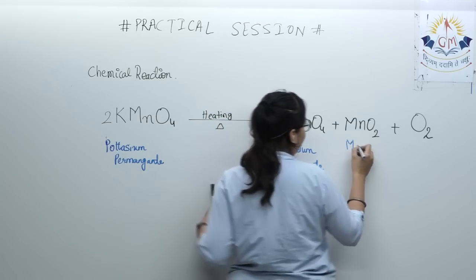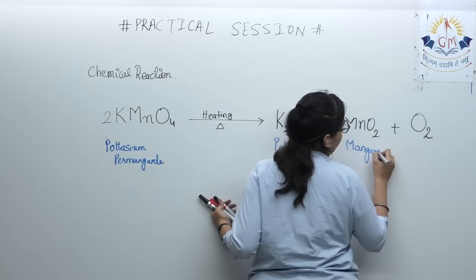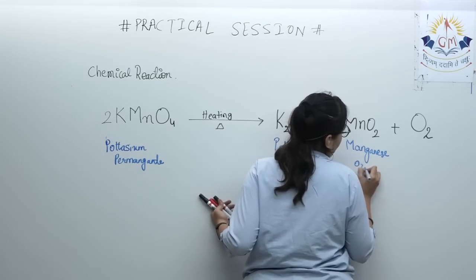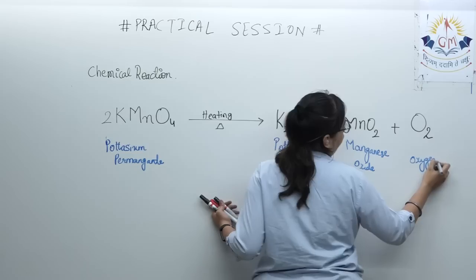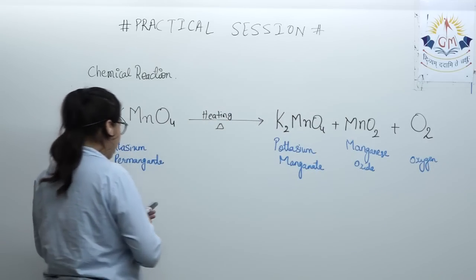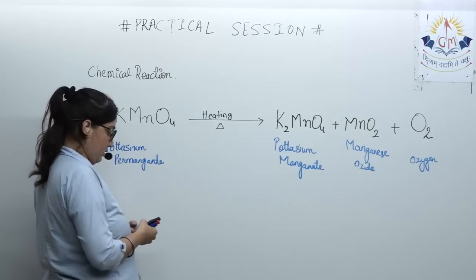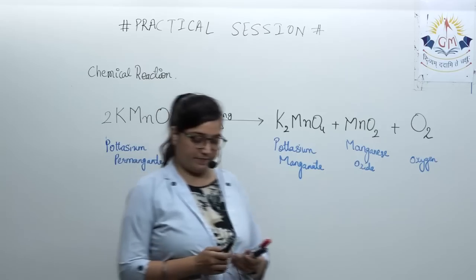This is manganese oxide. And this is oxygen. This is about the chemical reaction.